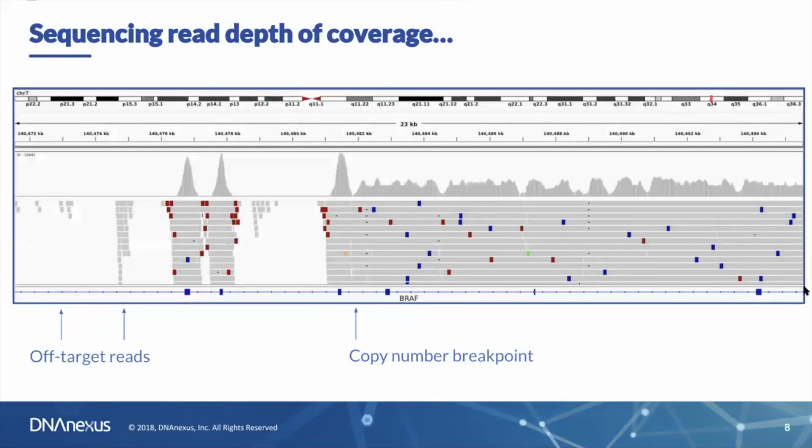So how do we accomplish the same with next generation sequencing? Our starting point is mapped reads to a reference genome. And from those mapped reads, we can easily calculate a coverage profile. Here I've shown you an example of a targeted gene. This is BRAF, the gene BRAF. The bottom track here is the gene model. These rectangles are exons that have been targeted. You can see the coverage up here on the higher track piles up around each exon.